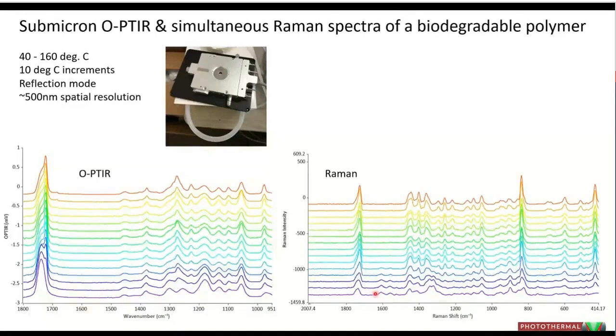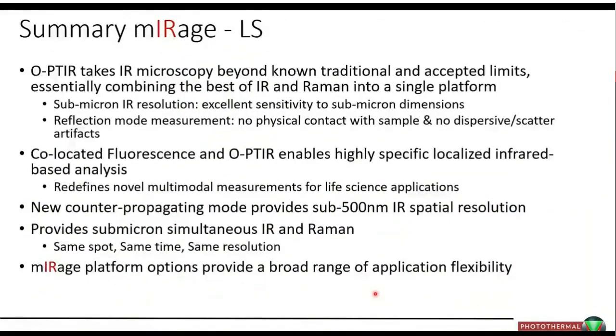So you can then combine these data sets to do 2D correlation spectroscopy and work out mechanisms of how things change. The mind boggles at how much information is there and how you can now use all of these new emerging mathematical tools to extract it. Because the more data you have, the more information you can extract out of it. And that brings me to my summary slide.